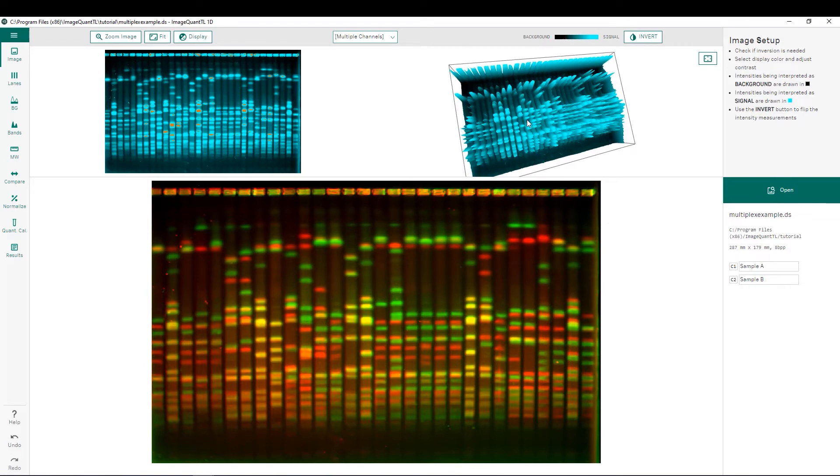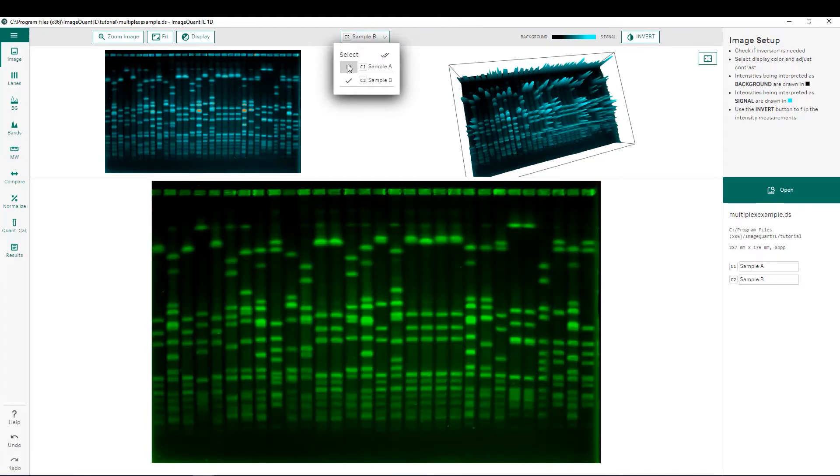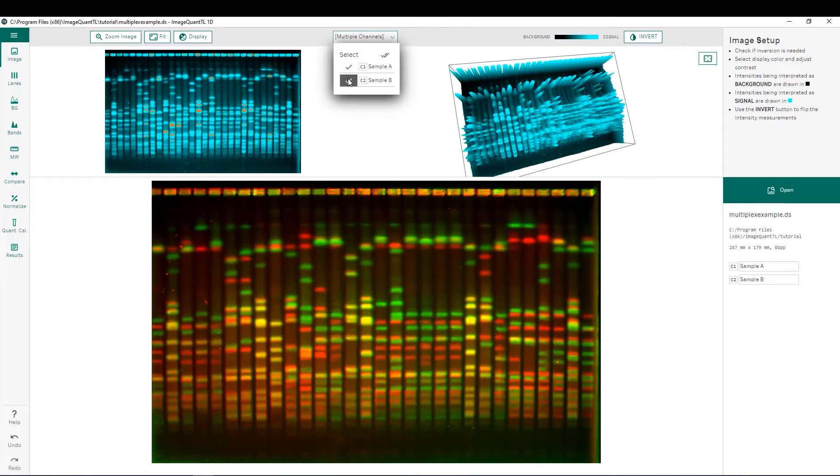If we are analyzing a multiplex image with multiple channels we can go ahead and toggle those on and off up here so you can choose to look at them together or individually.